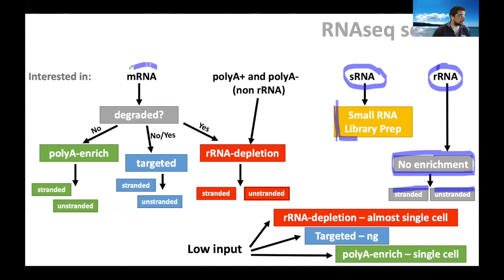If you're interested in messenger RNA, now things become interesting, okay? Is your sample degraded, okay? No, my sample is not degraded.